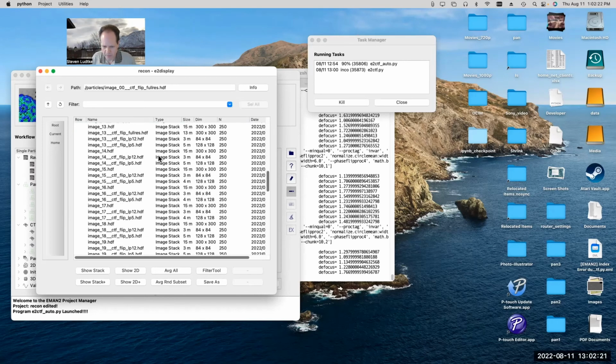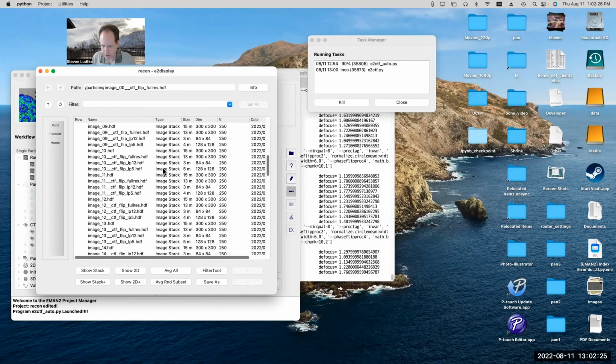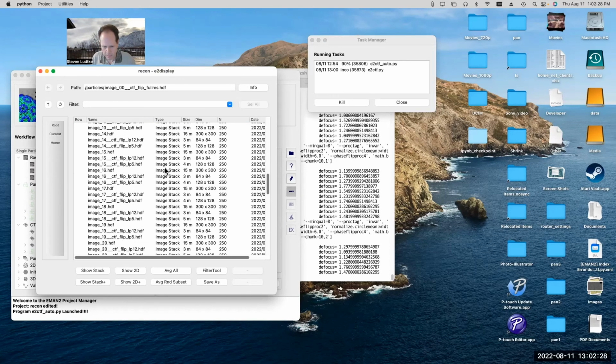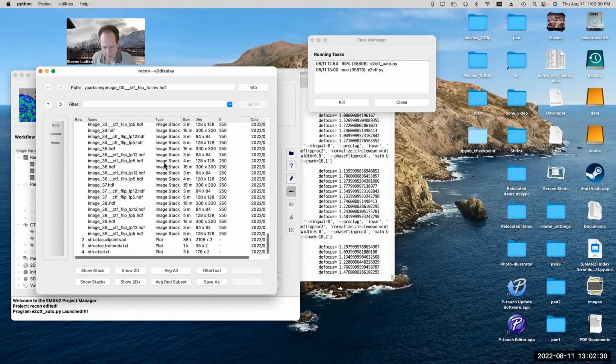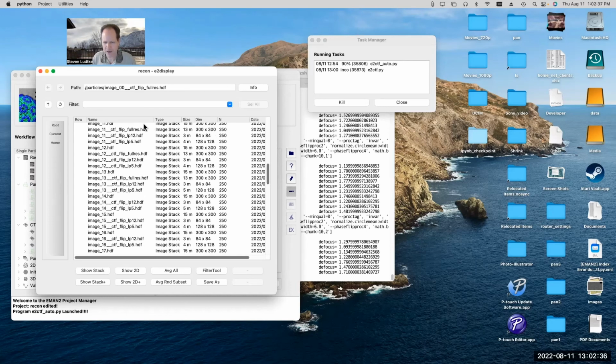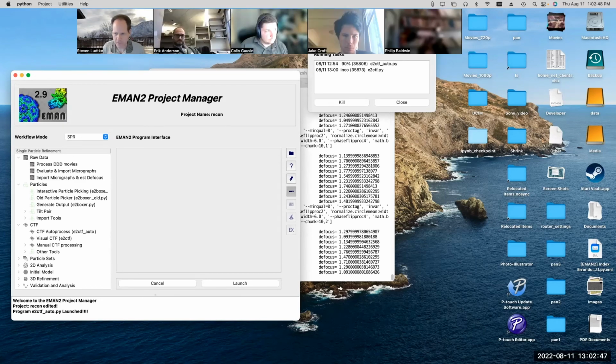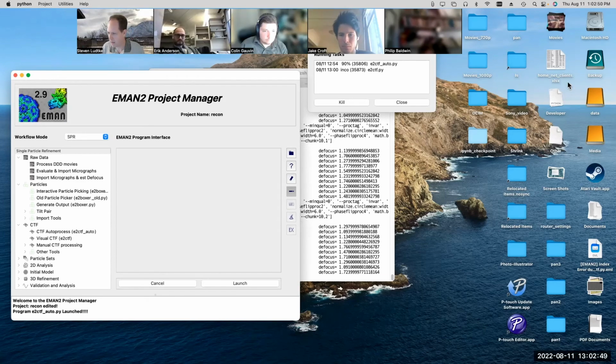All right, so we've gotten to be after 1 o'clock already here. I guess it's almost... oh no, sorry, it's doing the last type of file now. Yeah, it's still gonna take a few minutes to finish. So I'm gonna go ahead and just run a canonical refinement after the CTF stuff finishes, and I think we'll just call the session for the day, and then next week we'll get back to it.